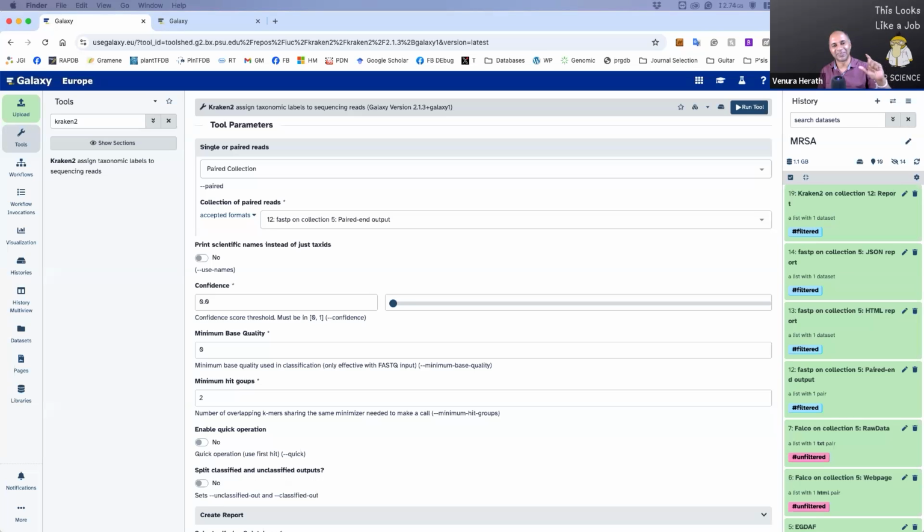Okay. There also we use a cool thing. What we do is when we sequence, we put an index tag. When we prepare the library, let's say you have samples coming from individual two, we put different tags. That way, we sequence them collectively, but they have a tag. So based on the tag, we can divide: this is individual one, this is individual two, this is individual three, likewise. So it can be easily done. I hope I answered your question.